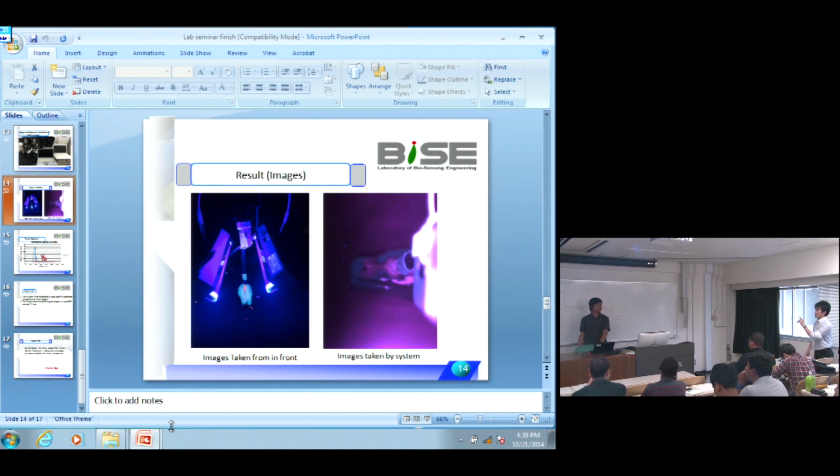And I have a last question. Is it possible to take a fluorescence spectrum by using a mixture, a homogenized liquid? I think it can be used as long as it has fluorescent substances. You don't need to measure the green paper directly. You can homogenize and extract. Then you can measure. That is simpler and you can get a clear spectrum.